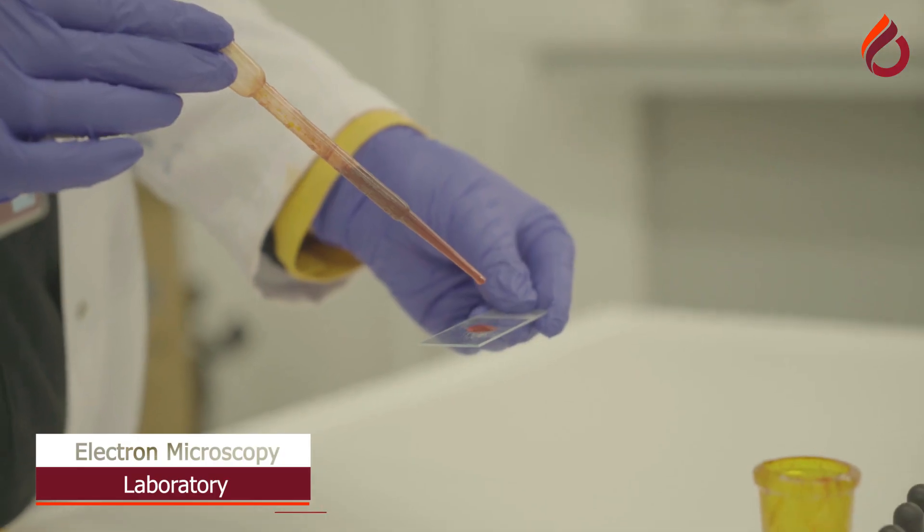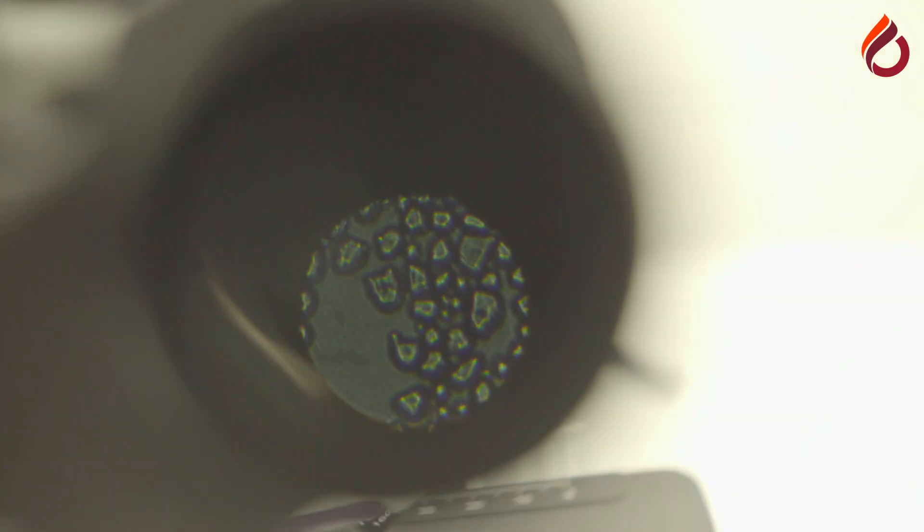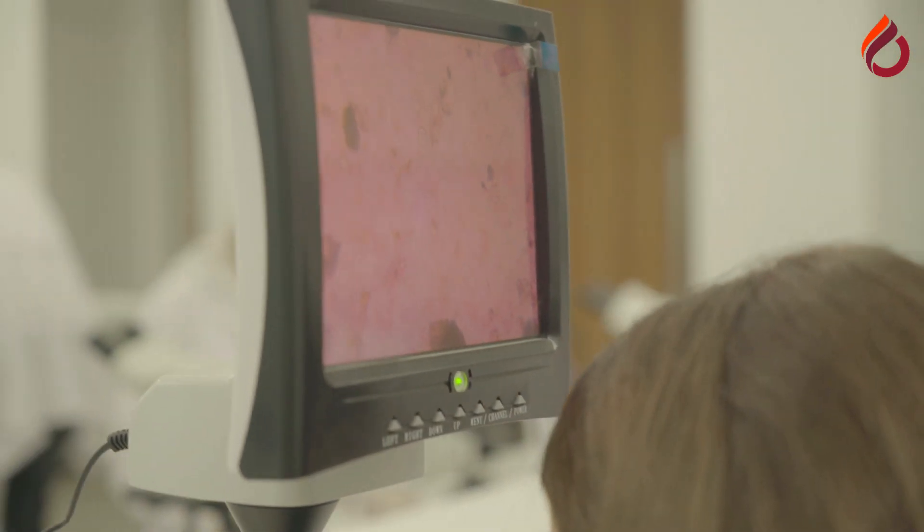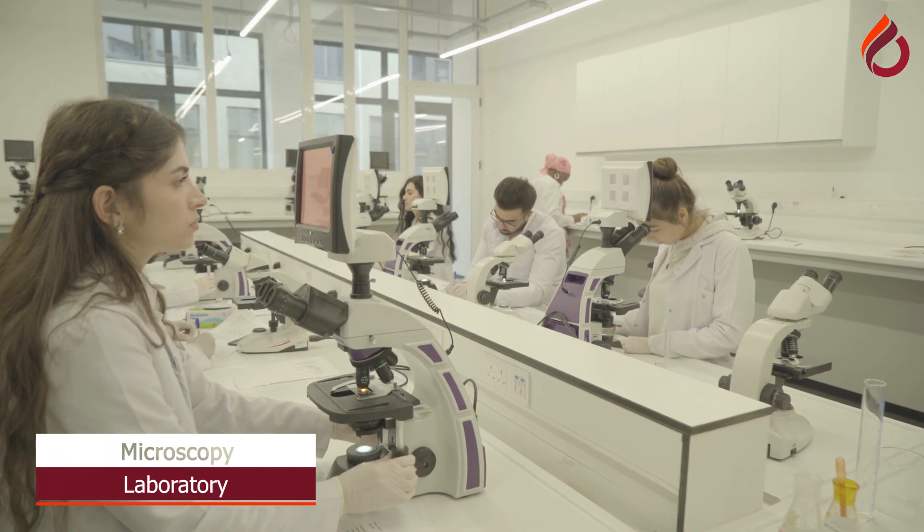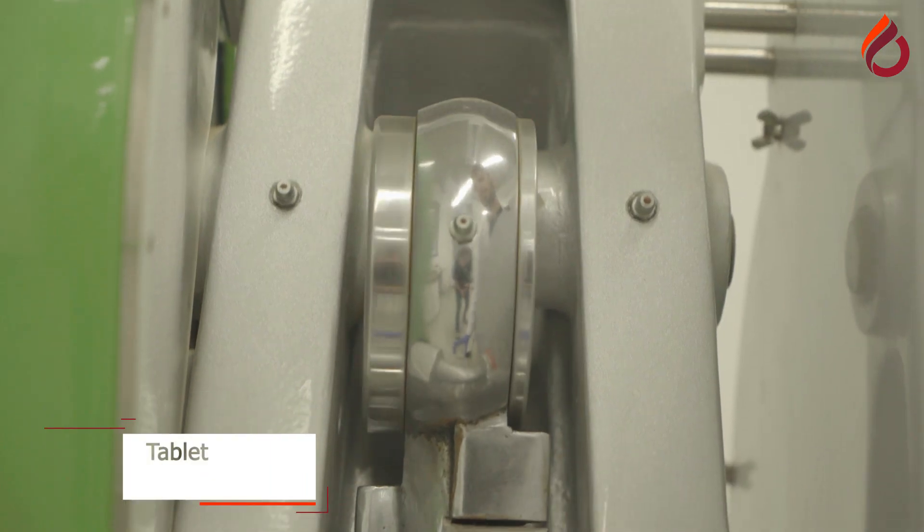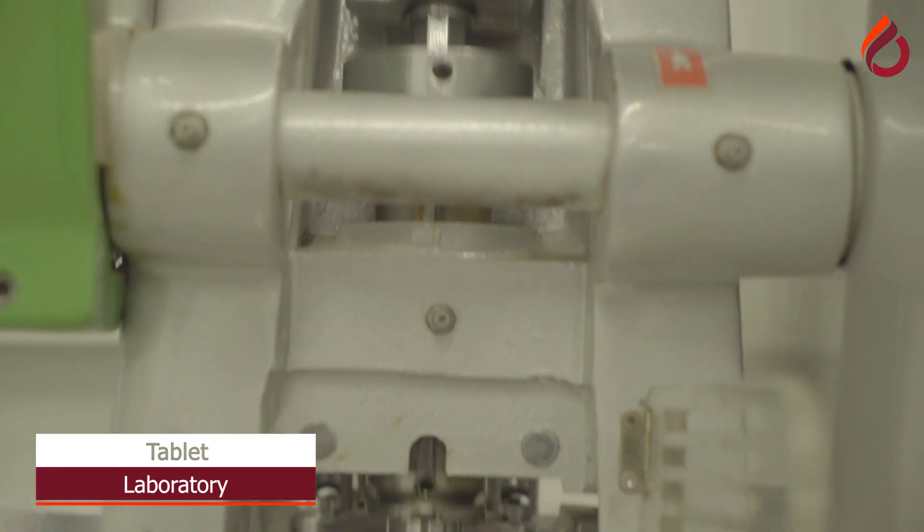Laboratories, the majority of which are found only at CIU in Cyprus, are designed to positively contribute to progress in various research areas of science such as cancer, genetics, food chemistry, food control, anatomy, microbiology, and robotics.